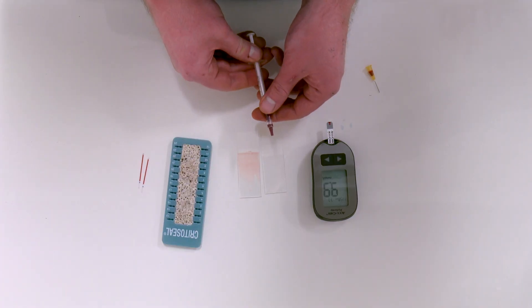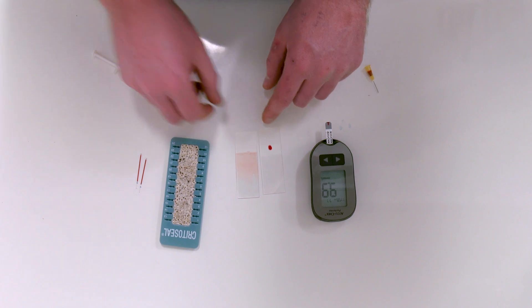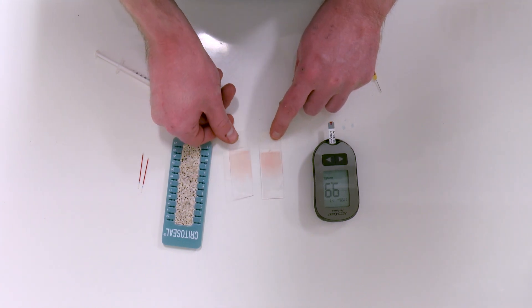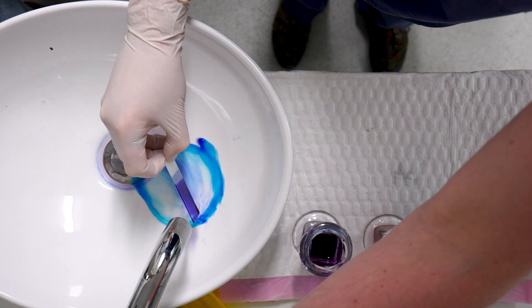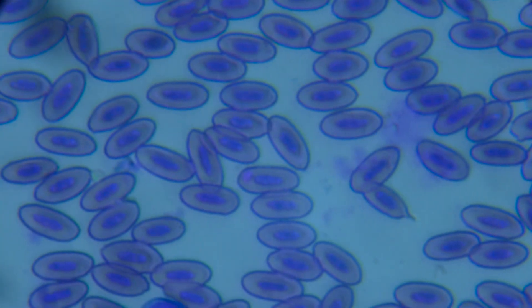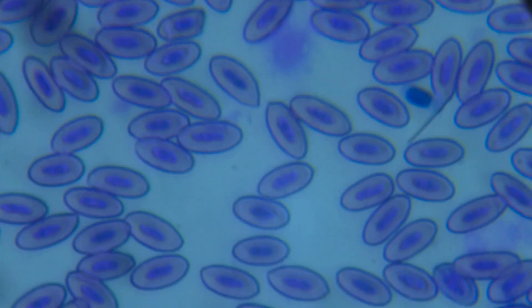To make the blood smear I like to use fresh blood. I place a small drop of blood near the head of the slide, then with another slide I form the smear. At Bonnarong Wildlife Hospital we use a Diff-Quik stain, and then we can have a look under the microscope to see if there are any parasites or any abnormalities on the red blood cells, white blood cells, or the thrombocytes.